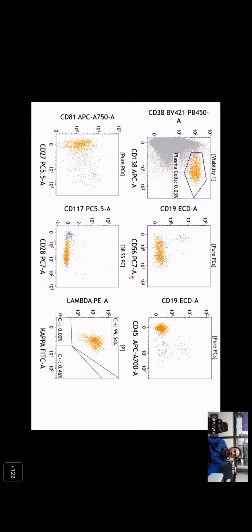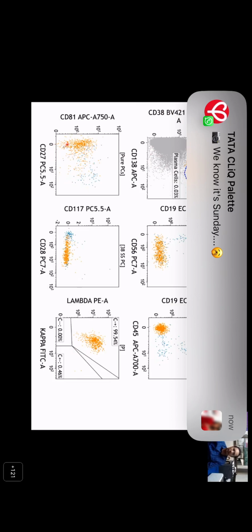Okay. But these are abnormal plasma cells, so we have to confirm their clonality. Immunophenotyping by flow was done to confirm the clonality, and on flow again we identified plasma cells by using CD38 and CD138. You can see there were very few normal plasma cells, which showed CD19 positivity, but the majority of plasma cells showed CD19 lost, CD56 expression, CD45 was lost, CD81 was down-regulated, CD27 was lost, and CD28 was positive, although CD117 was not there.